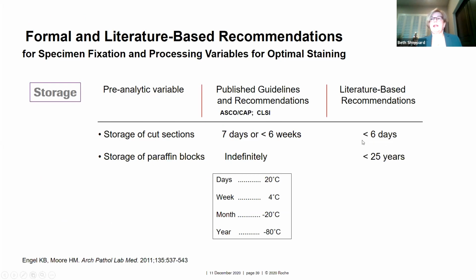The literature actually says less than 6 days. Storage of paraffin blocks can be indefinite, and some of the literature says less than 25 years. The usual mode is 20 degrees, 4 degrees C for a week, -20 for a month, or a year at -80. Those are the recommended temperatures that some of these guidelines have given.